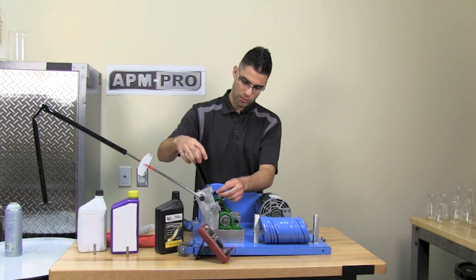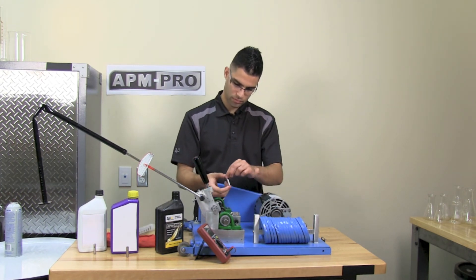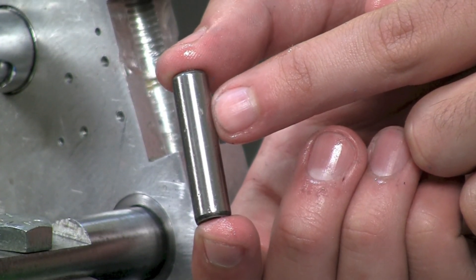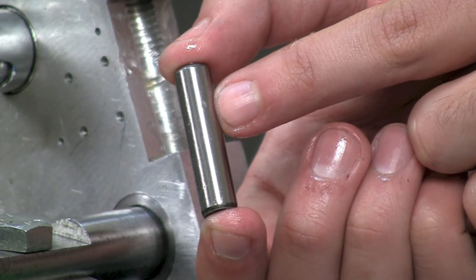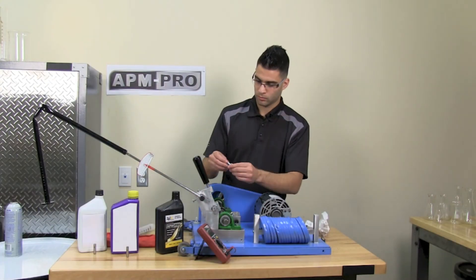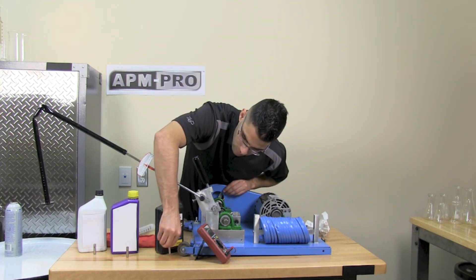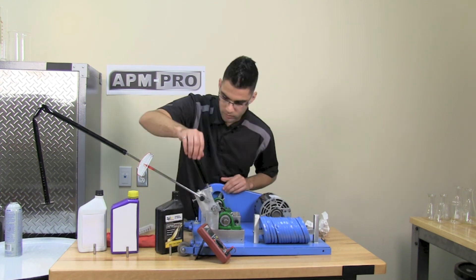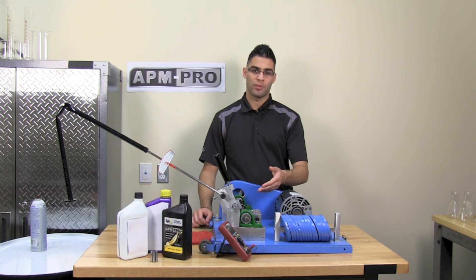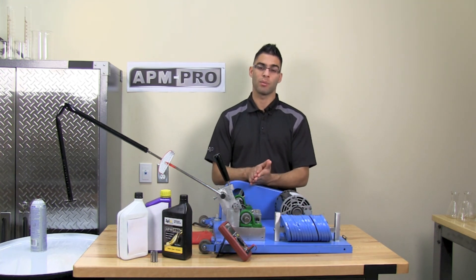I will now show you how the bearing performed. As you can see, the scar is very small compared to the other synthetic motor oil and the regular motor oil. This test demonstrates that APM Pro has bonded to the surface and created a one molecule thick layer which is protecting the two metals from rubbing against each other.